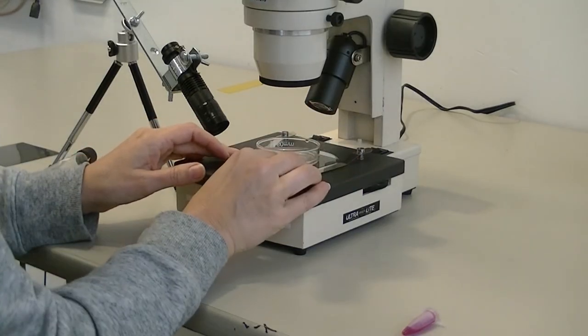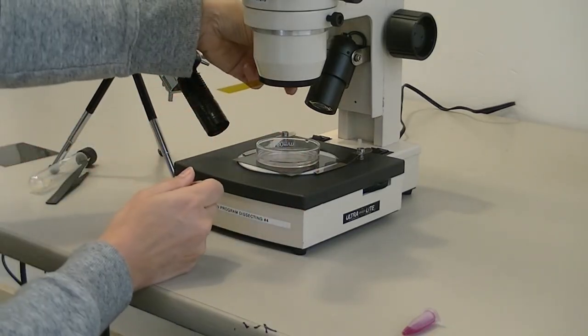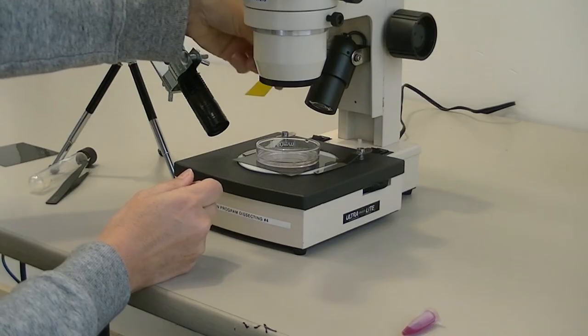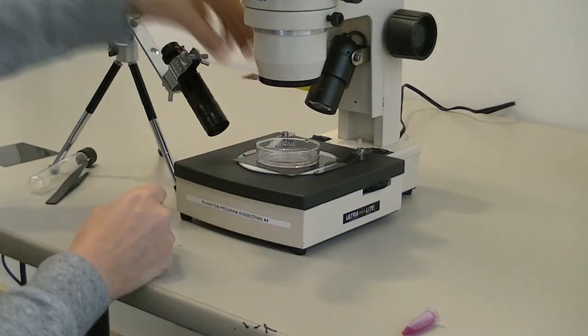We have a piece of yellow filter here that we've swung out of the way, and for the Nile Red process, we will put it in front of the objective lens.